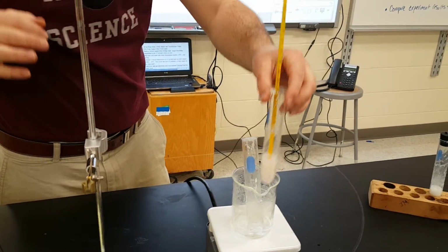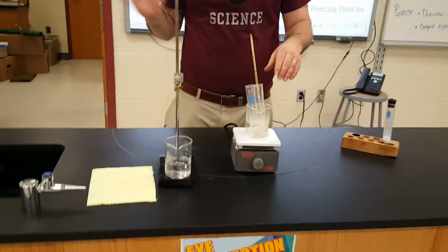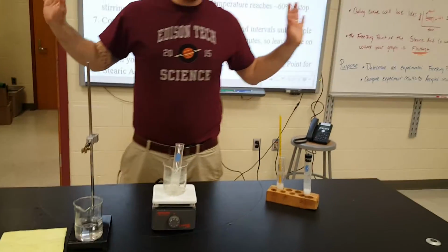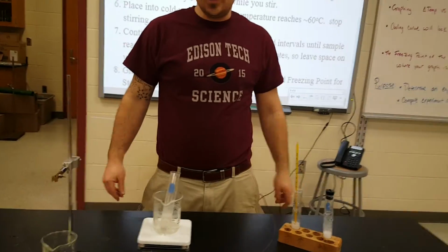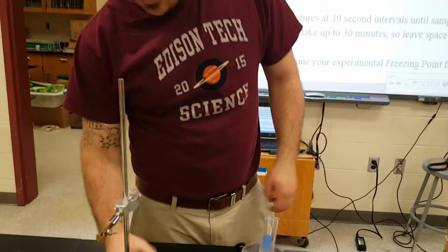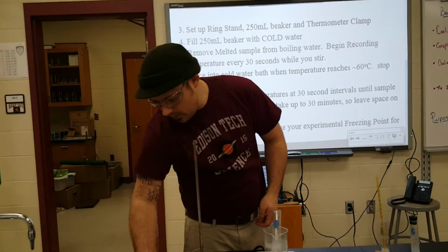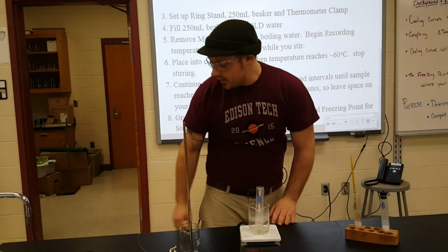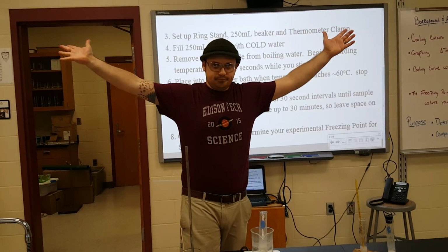So you put it back into hot water. So you clean it up. Done. Or if you're the last lab of the day and Mr. Mills or I tell you, listen, put them in the rack. The thermometers will be stuck in there. That's fine. We'll deal with that later when everybody's done with the lab. Empty the liquid. Break down your setup. Mop up your lab table. Make sure you're off on your hot plate and unplug. Done. Thanks, everybody.